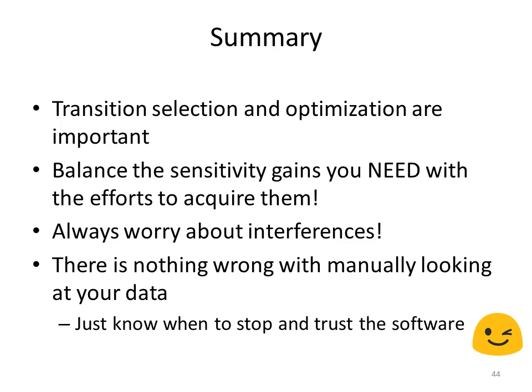Okay, so transition selection and optimization are important. The other thing you may find is when you're optimizing and you pick a peak that you think is your peptide, if it's not actually optimizing, it might not be the right peak. If you're optimizing and trying to improve the signal, you should hopefully see some kind of improvement. Otherwise, it might not be what you think it is.